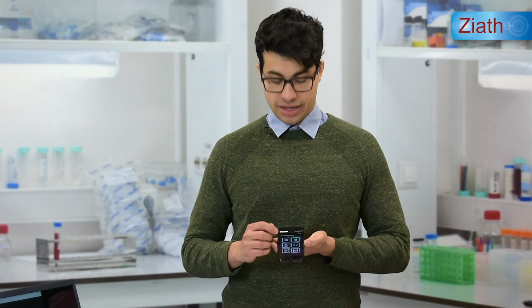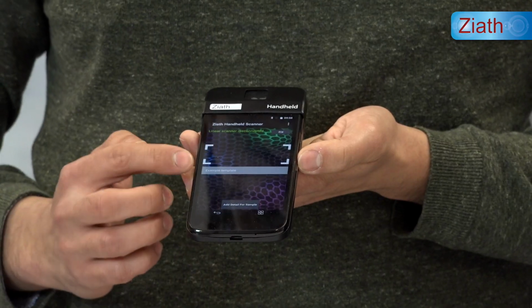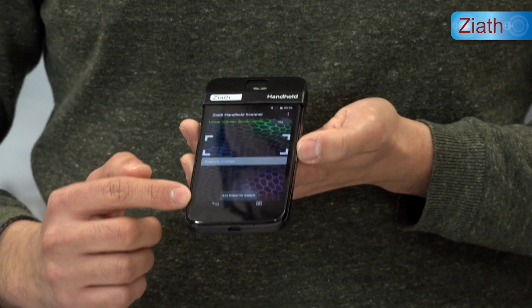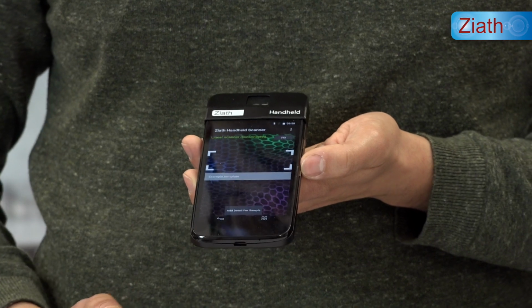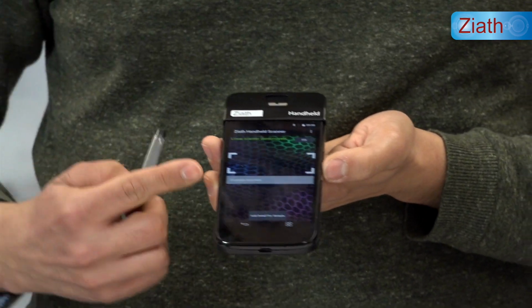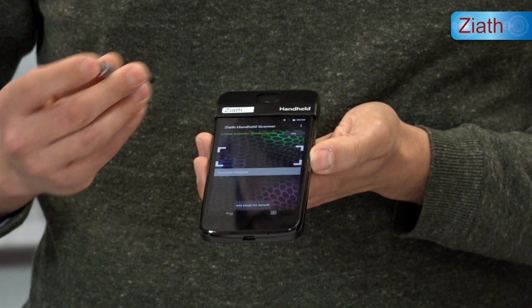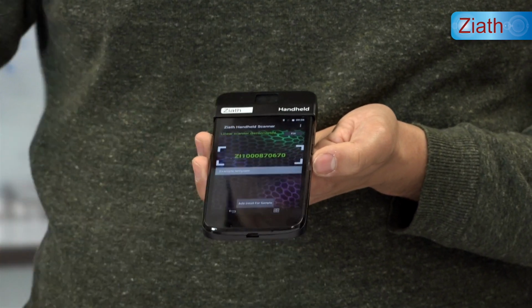If we open the Add and Edit Sample Information icon, we can see the template that we have added. If multiple templates are on the handheld, they will be shown in the list, and then we can select the template that is required. The example template is highlighted, so that one will be used. We can then scan the sample and add details for the sample.